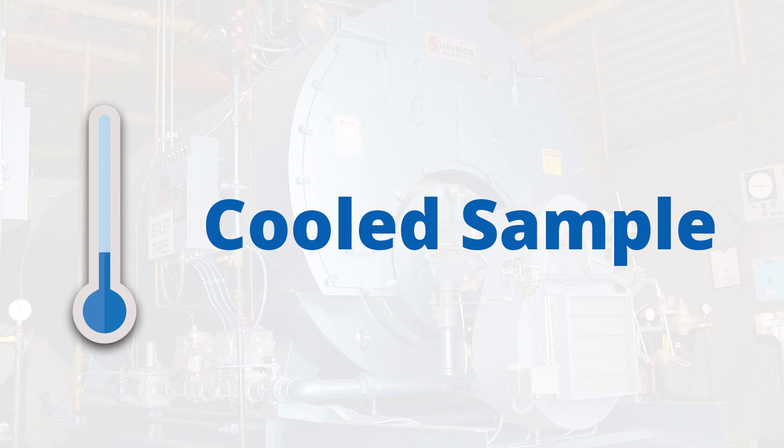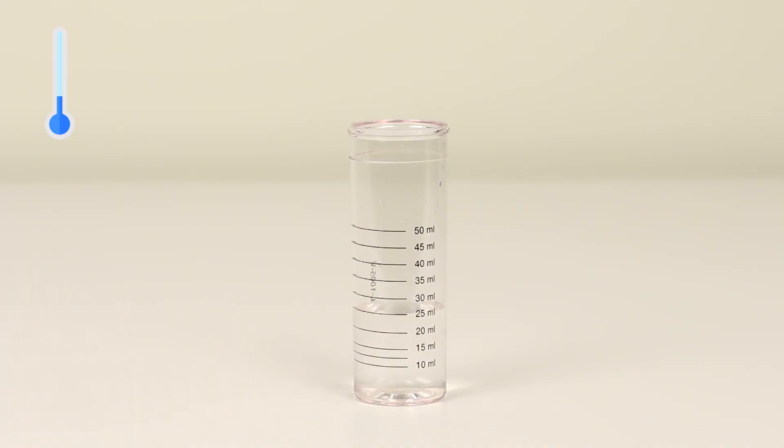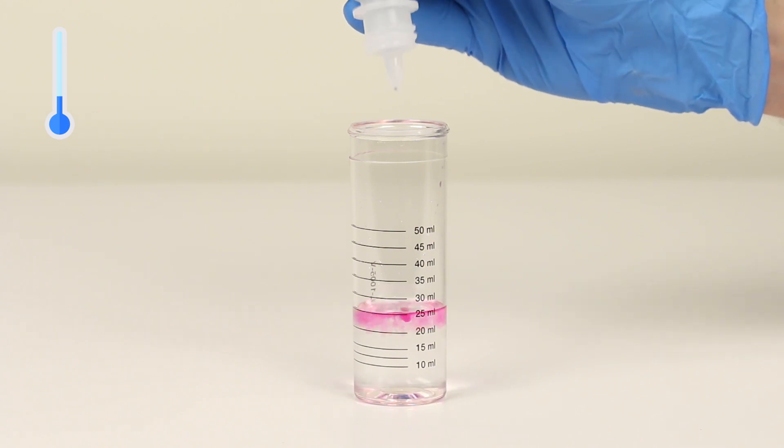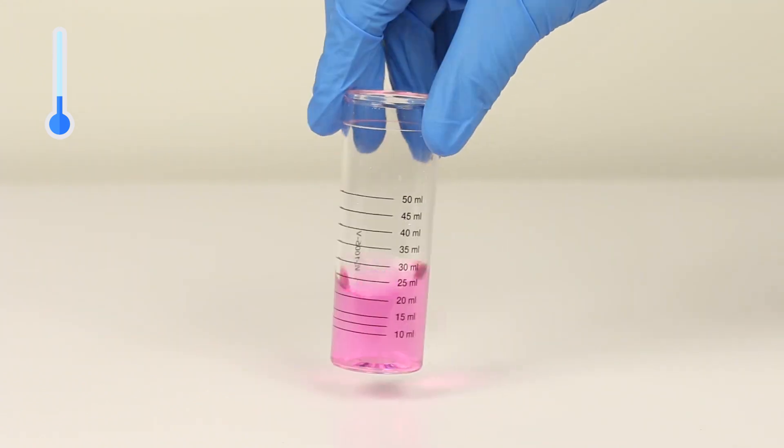First, we'll run the test on a properly cooled sample. Add one drop of phenolphthalein indicator and swirl to mix. The sample should turn pink.